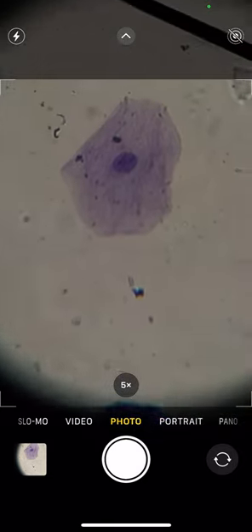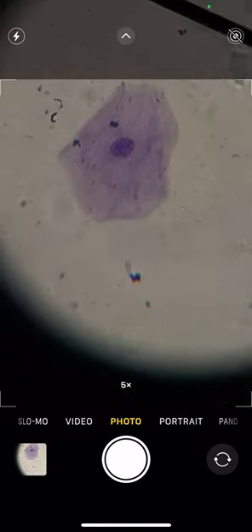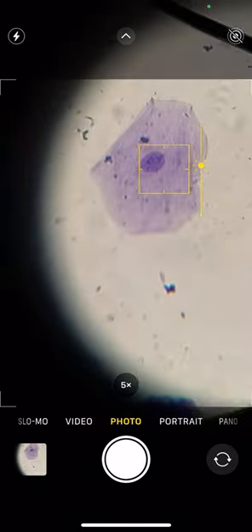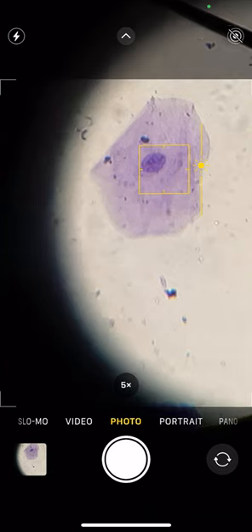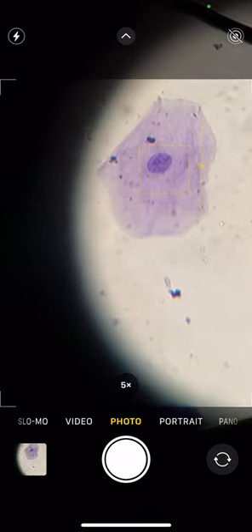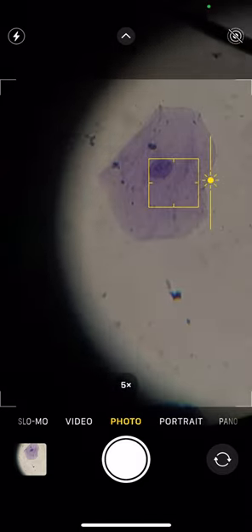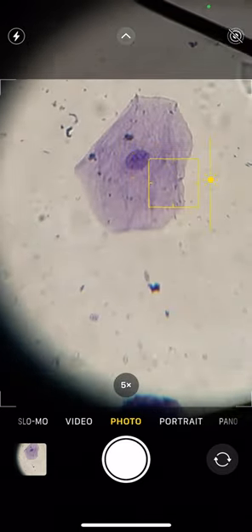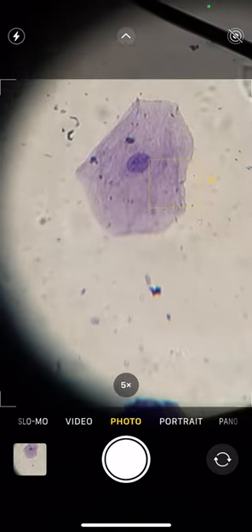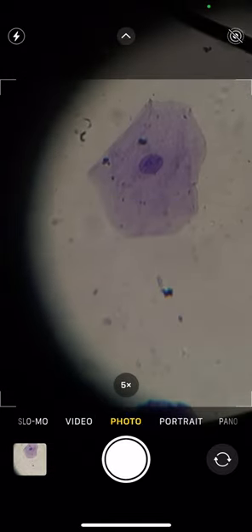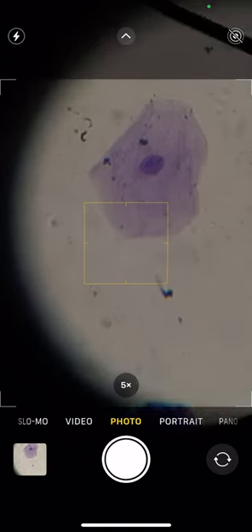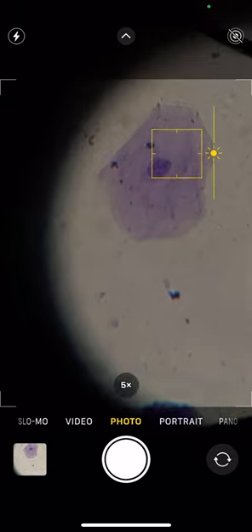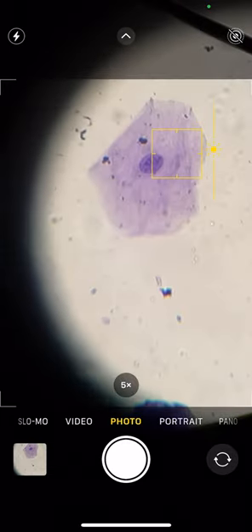There's a cell, a cheek cell, human cheek cell. You can see the wonderful and amazing chloroplasts, or not chloroplasts, I'm sorry, all this stress of trying to just get in focus, the nucleus, the cytoplasm, and of course the cell membrane keeping it all together.